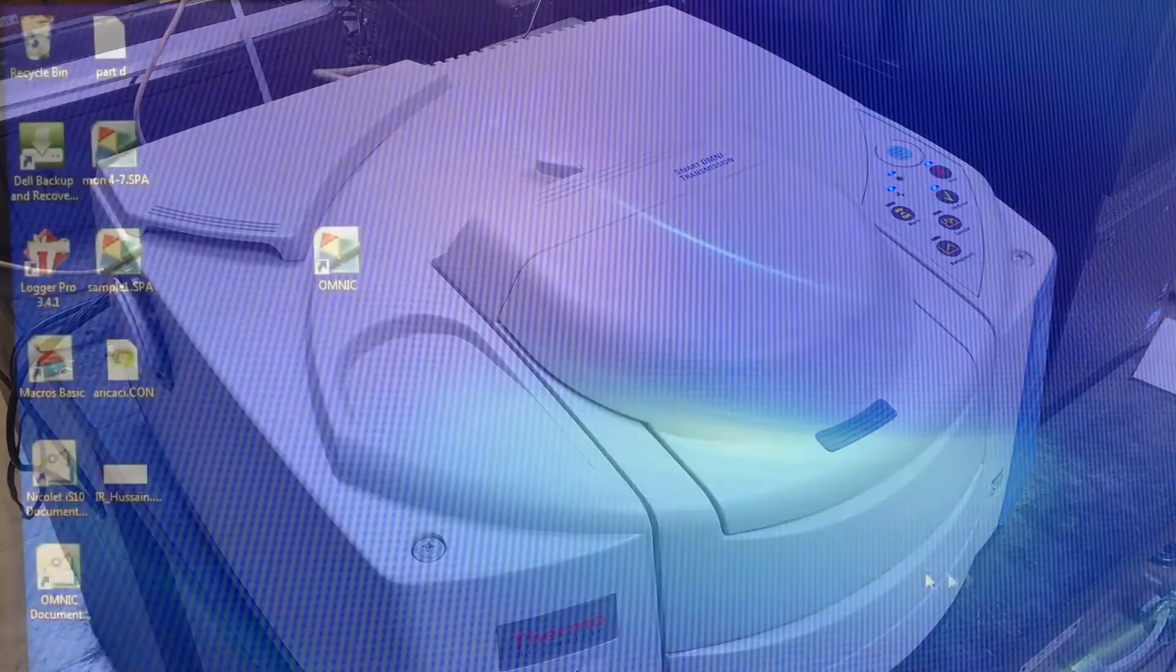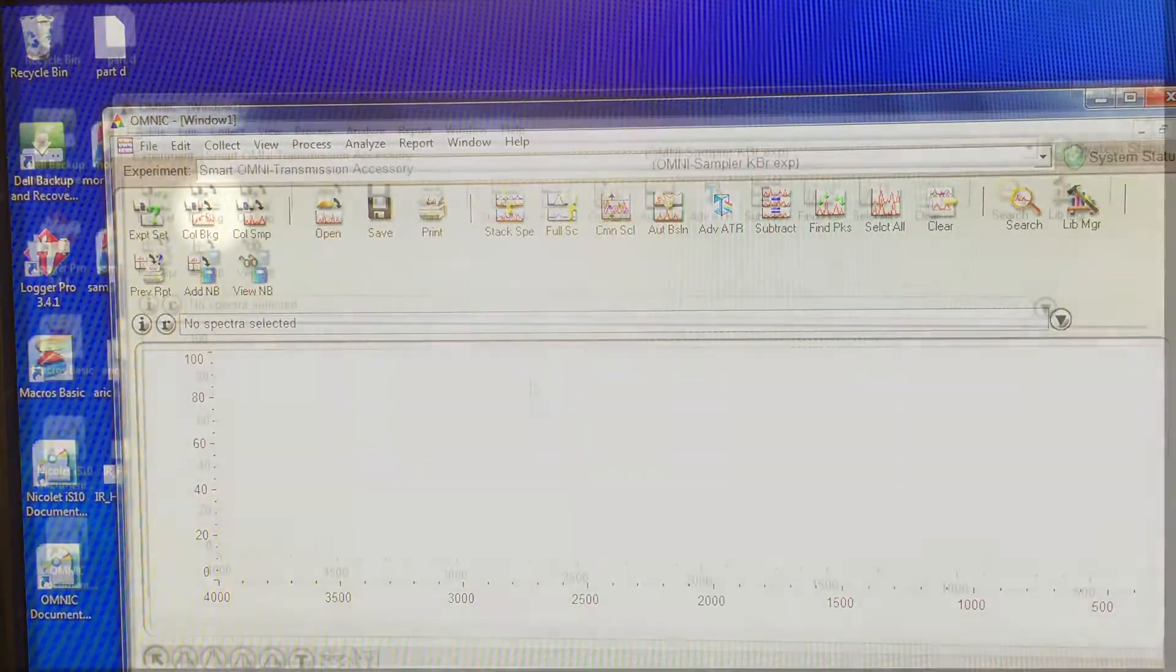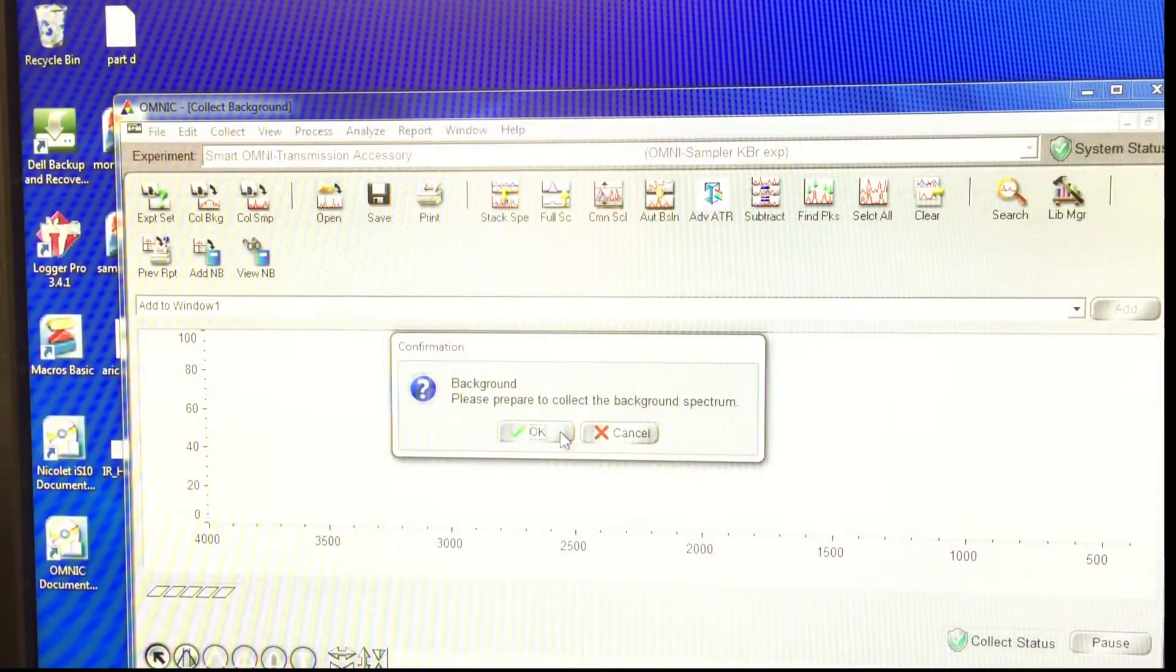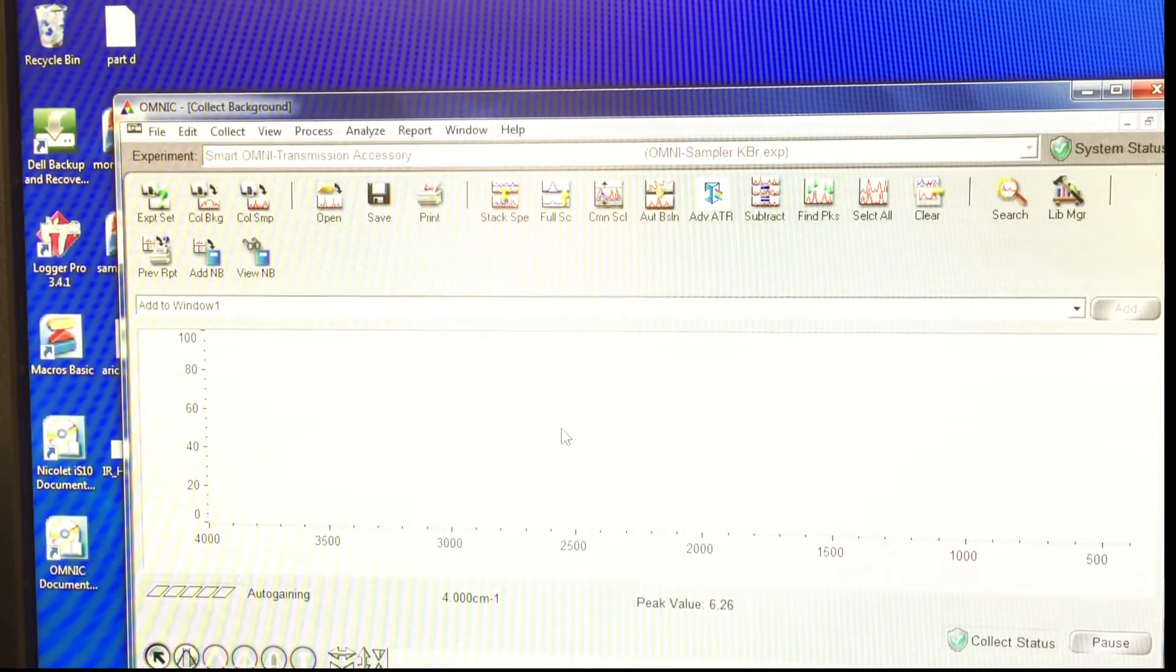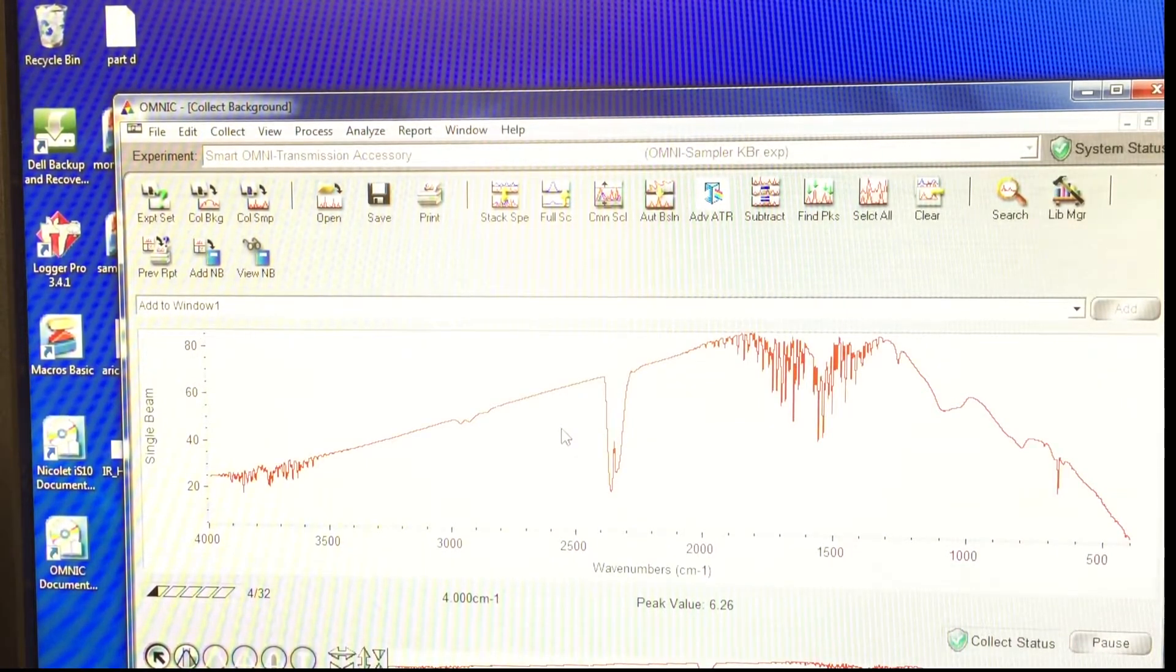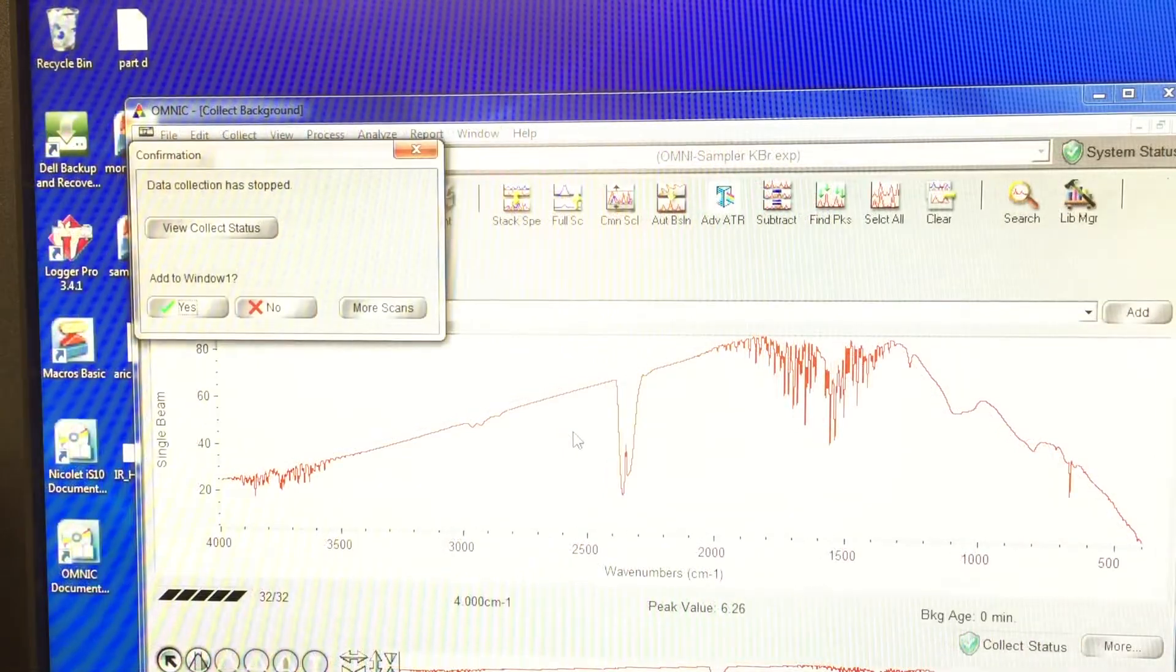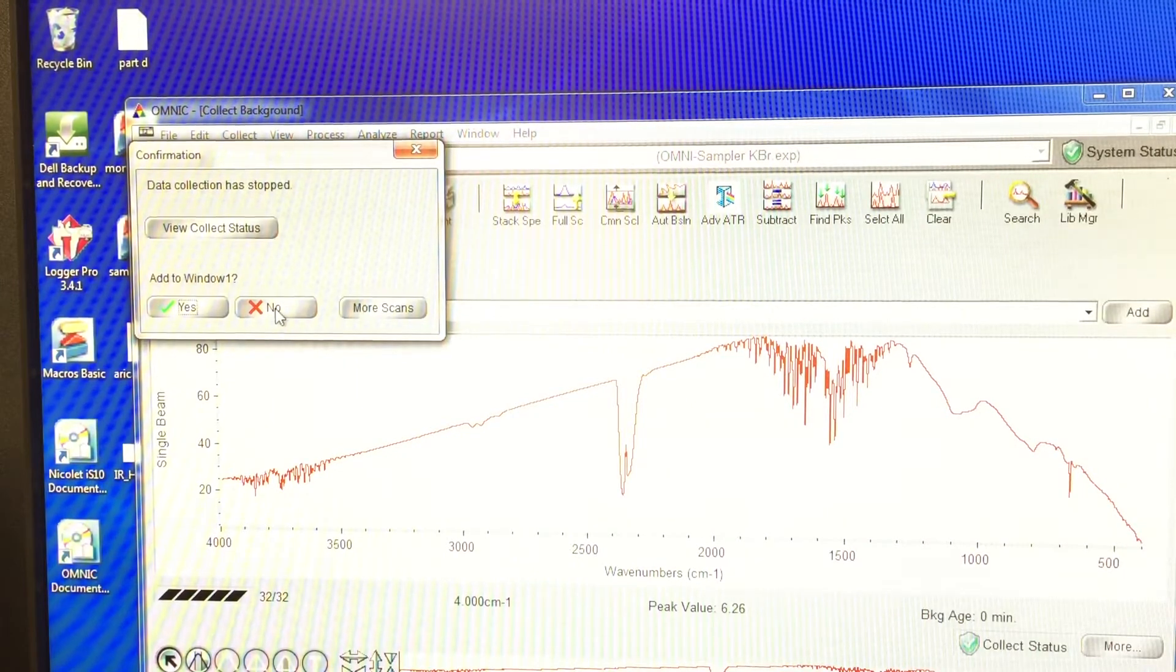Open the OMNIC application and click Collect Background. When the scan is complete, a dialog box will appear. This is just the background, so click No. Don't add it to the window.